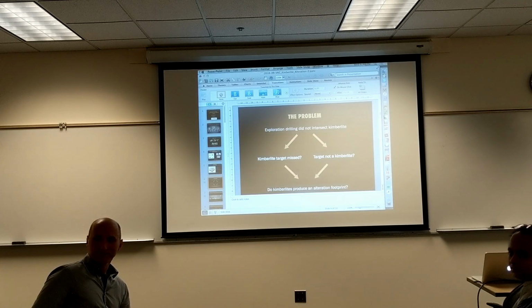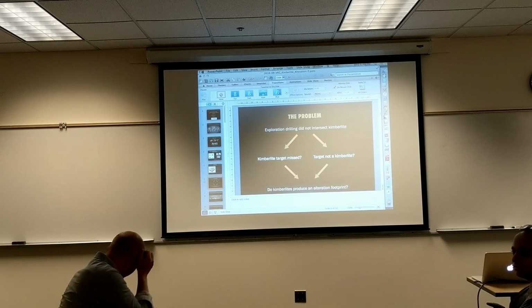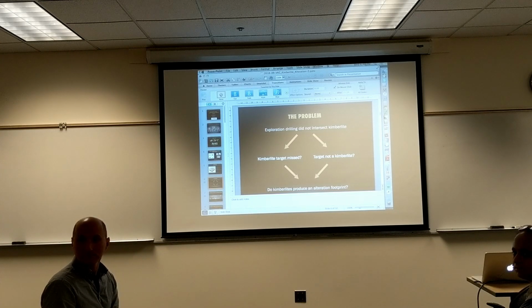Sample preparation. What does it include? Clean, dry drill core? Yeah, but let's say if the sample is not well dried, does it affect? Yeah, it has to be dry. If there's any water on the surface, we'll be measuring that water.